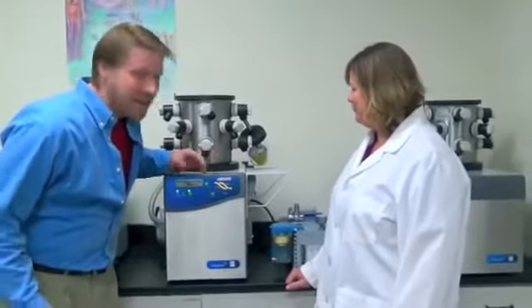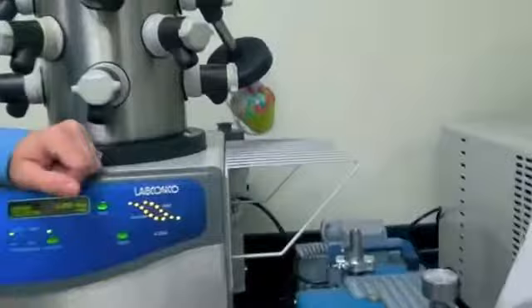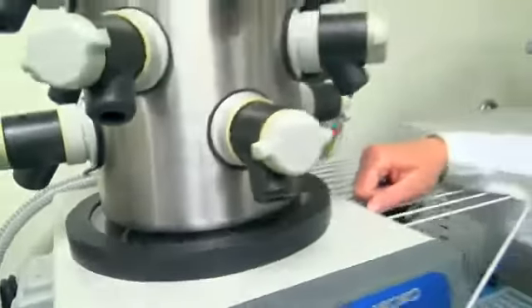If you want to come in and look at this cupcake closely — it doesn't actually look any different, does it Kelly? No, not at all. The moisture that was in the cupcake left — it went from a solid to a gas and it accumulated on the coils.